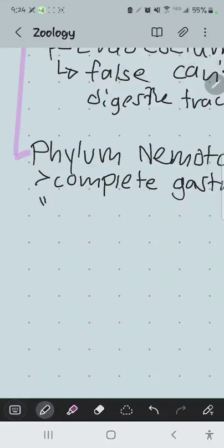But the term vermicelli, which is a type of pasta noodle, isn't vermicelli like one size smaller than spaghetti? And then angel hair is the thinnest of the noodle pastas. Vermicelli, the name literally comes from worm. And this is basically a pile of roundworms that were removed from a person. So you can see that it kind of looks like pasta noodles with holes there. But anyway, the nematodes basically have this tube within a tube body plan.